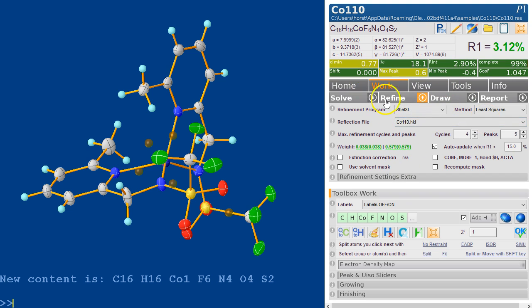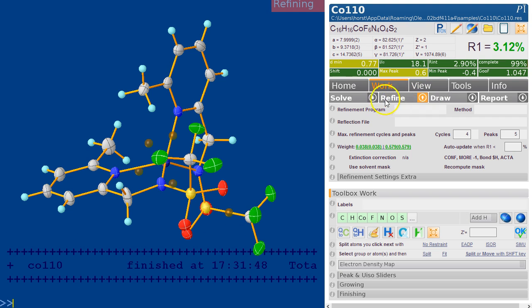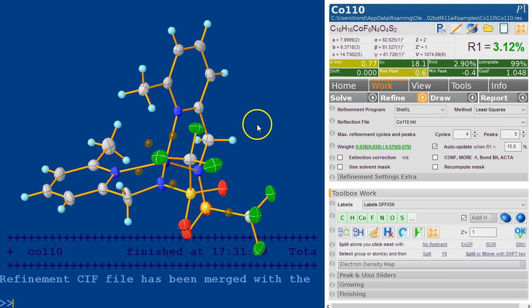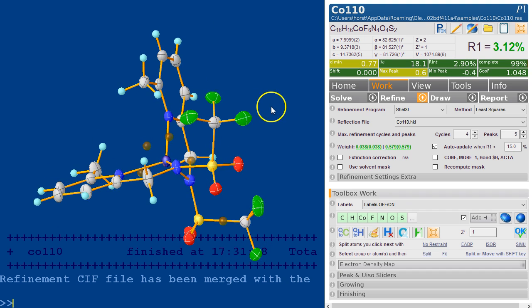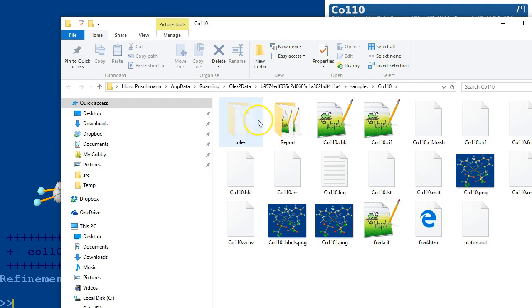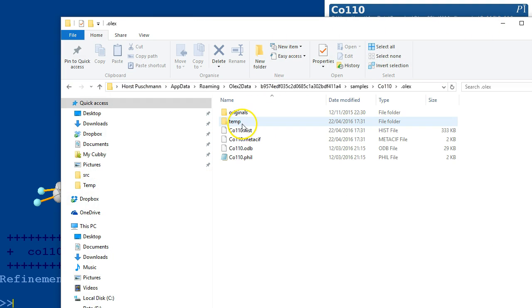When you press refine, Olex 2 generates an INS file from its own structure model. That INS file is copied to a refinement location which you can explore here. It's the hidden folder dot Olex.